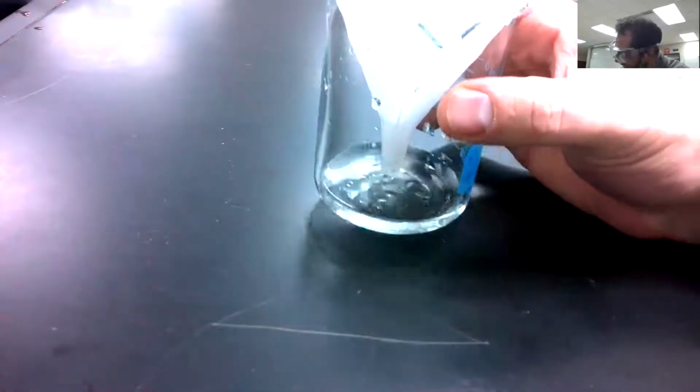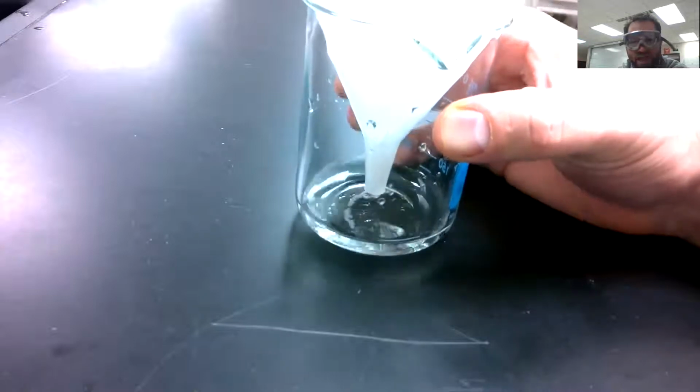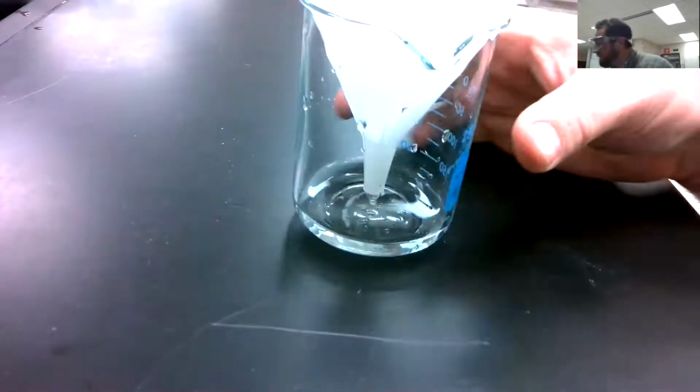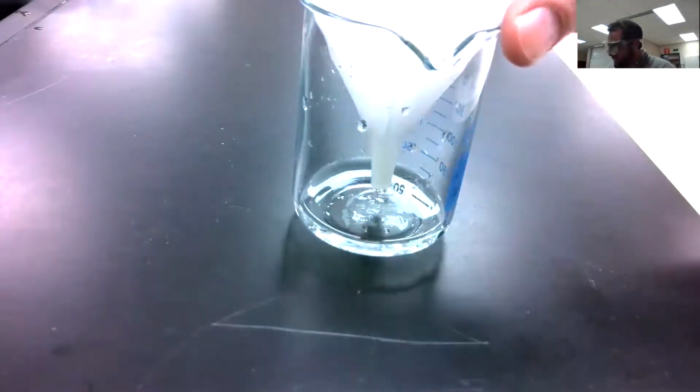And we still have a clear filtrate down at the bottom. That's excellent. That means we did a pretty good job of making sure that all of our solids stayed in the filter paper. And yeah, we are very close. Just a couple more drips here.